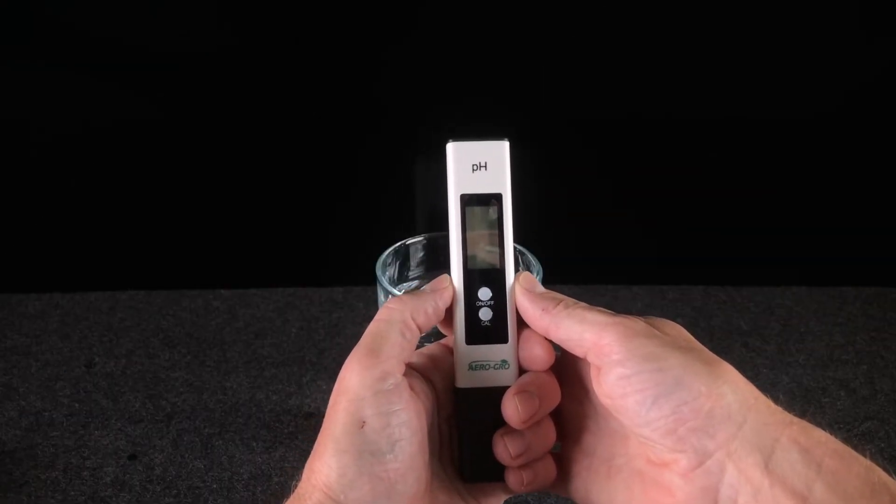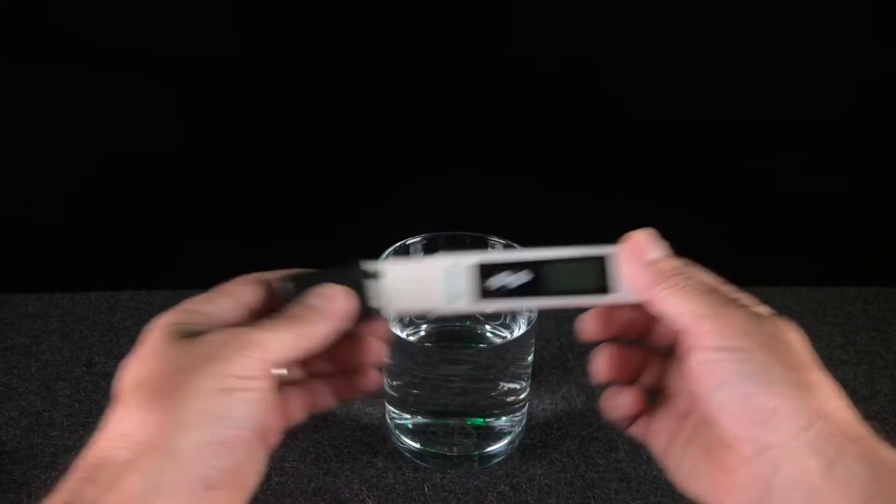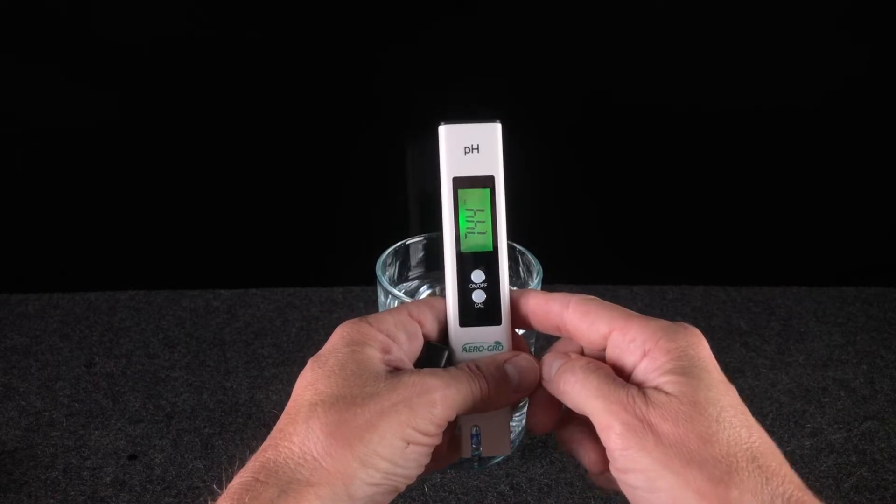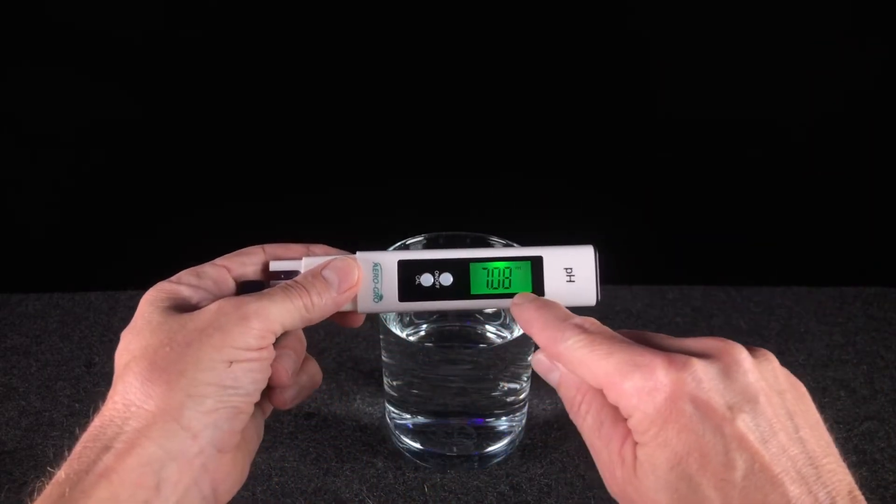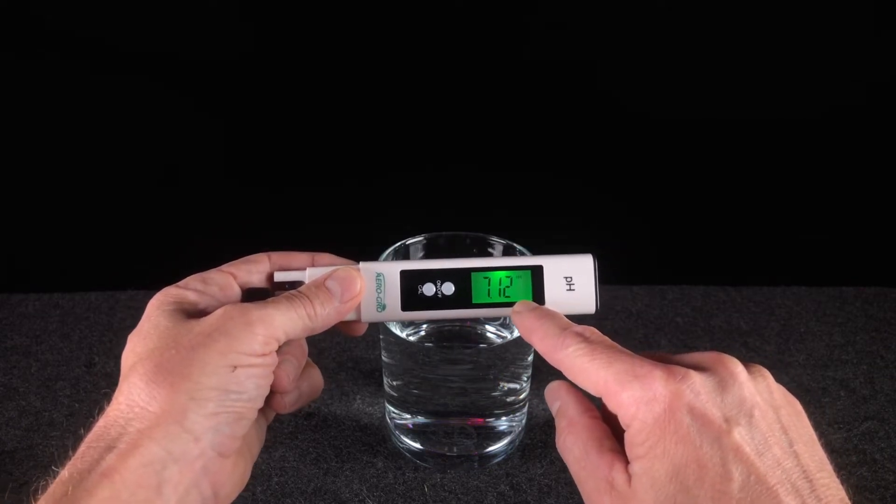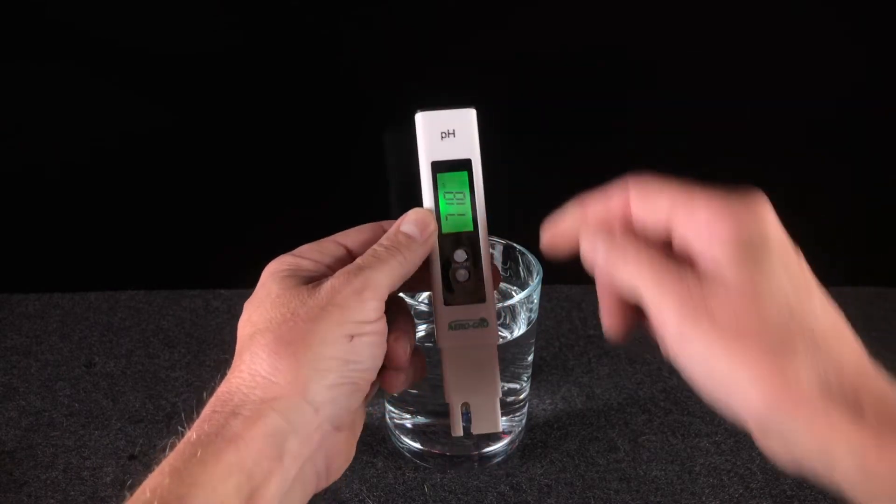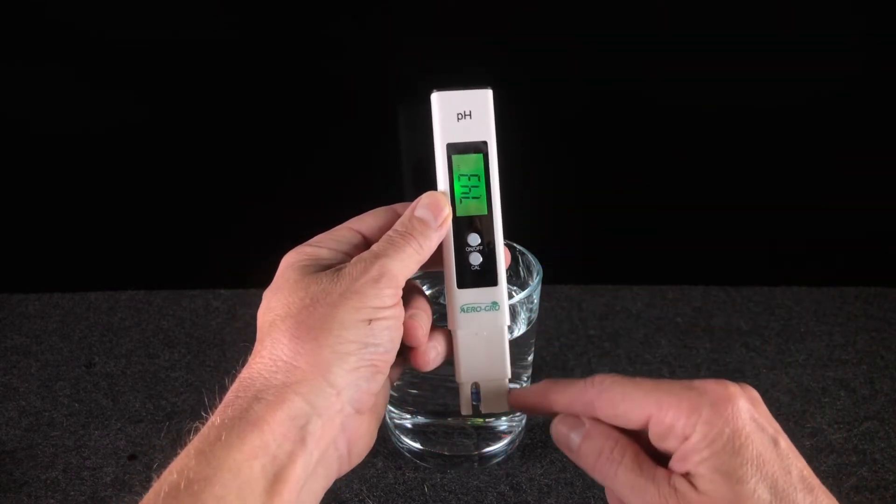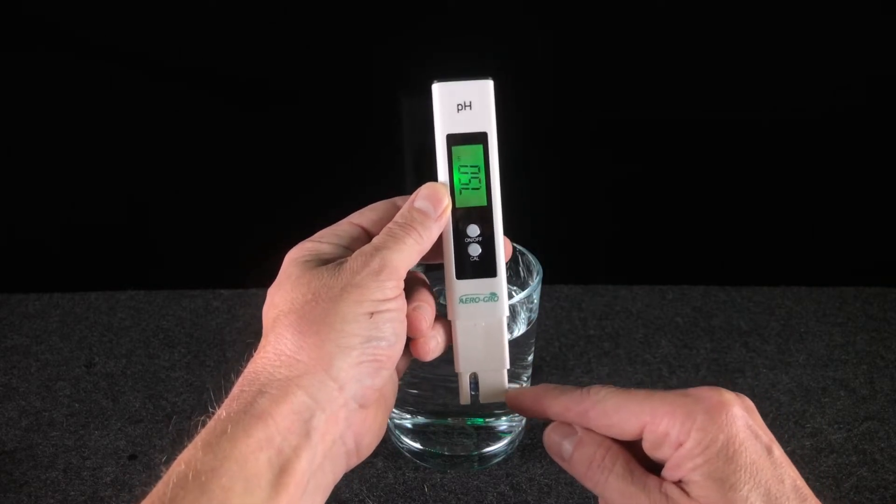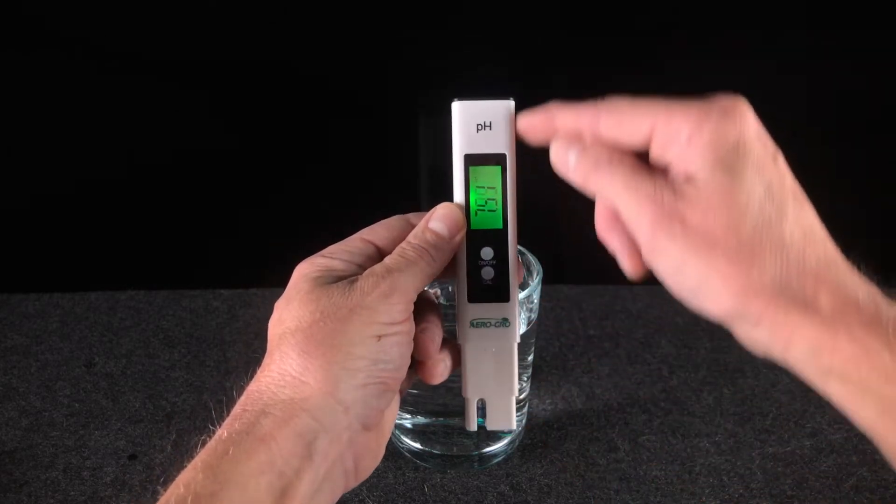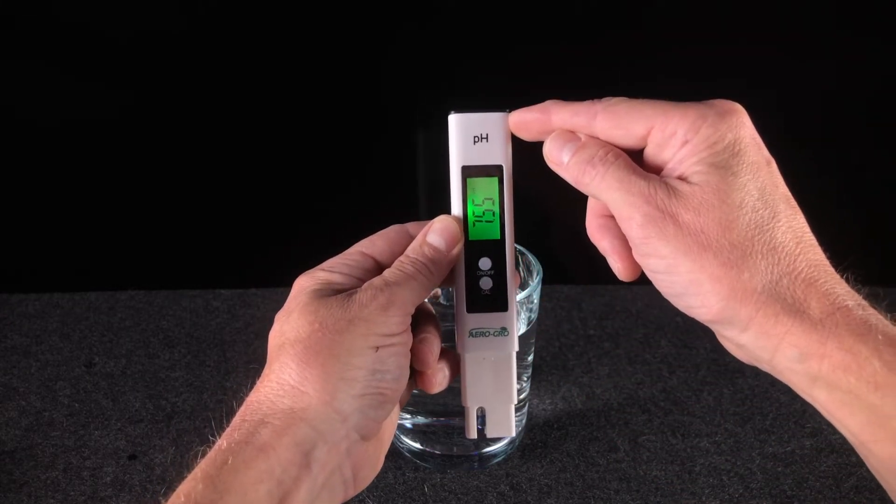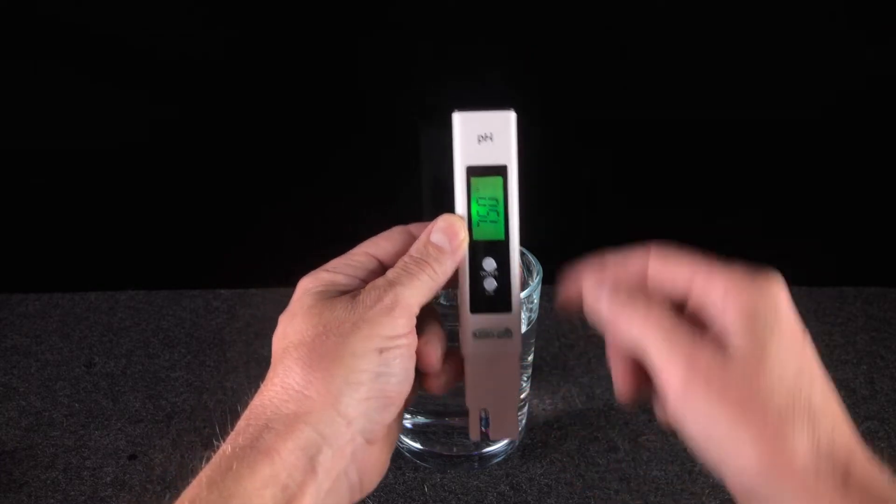To take a reading with your new pH meter, begin by removing the cap and then single-clicking the on-off button. Notice how there's a bit of drift to the numbers. This drifting is completely normal behavior for these types of meters. Also notice how the bottom portion of the meter, the part that's covered with the cap, is the portion that you'll be dipping into the solution. That's the waterproof portion of the meter. The top portion of the meter is not waterproof, so please do not dip that in the water, just the bottom portion that's covered by the cap.